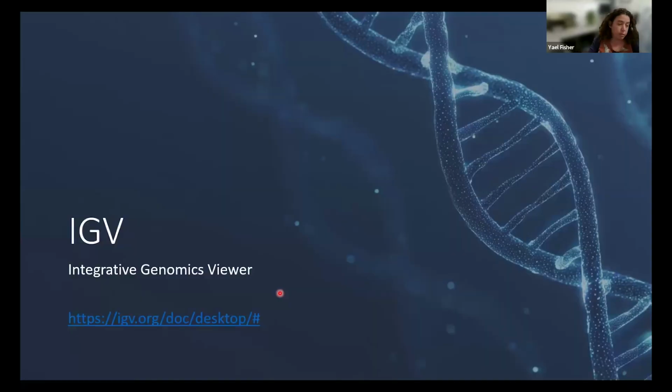I think it's from the Broad Institute. I'm going to talk a little bit about the basic features of IGV, but if anyone is interested in going more deeply into it, this is a link to their user manual, which is very user-friendly, and you can find out a lot about it.